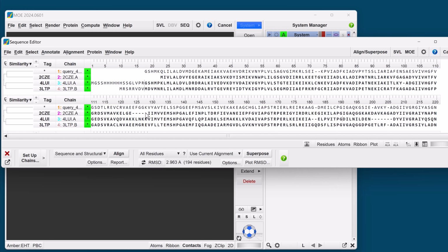In any case, the homology modeling application is going to be using the backbone geometry from the template, and in regions where there are indels, MOE will be using the loop modeler by default. Since multiple models will be generated and written to the database along with scores, we can later analyze these models to select the most appropriate.